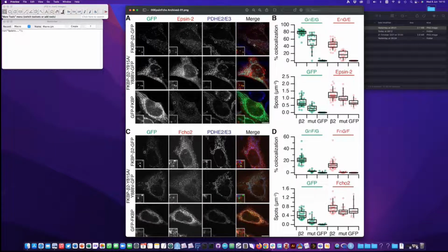The other thing to say is that we have this grout between the different squares here. If you use some of the other montage makers, they don't put in a grout, and that looks ugly in my opinion. There's also a rationale to this: the grout here is a little bit narrower than the grout here. That's because these are from one protein and this is from a different protein. So it helps you to see quickly that this is one experimental condition and this is another, and these are related and these are not.